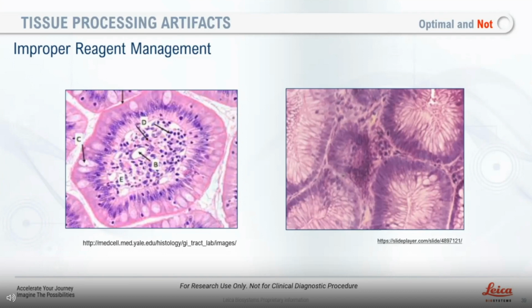On the flip side of that, well processed tissue can be great, right? It's ready for everything downstream. But I have walked into laboratories where processed cassettes have been left on the embedder for not only hours, but I had a lab tell me they left it in the embedder for about a week. Well, the temperature is high, and that long-term exposure to that temperature eventually affected their IHC, especially sensitive markers like nuclear markers. So that's a great question. Interesting. All right, next question.